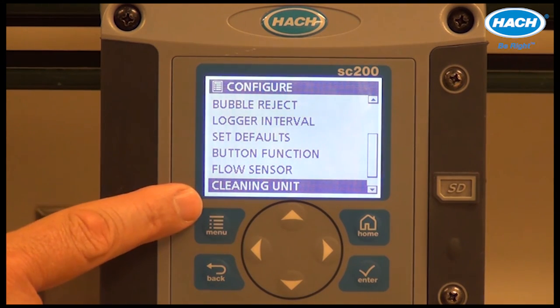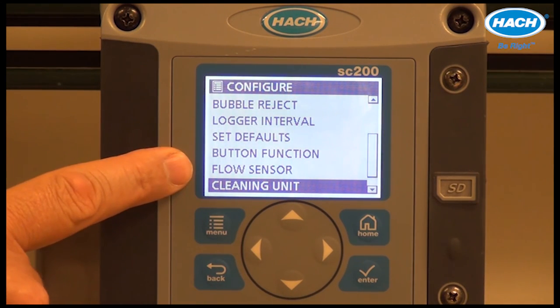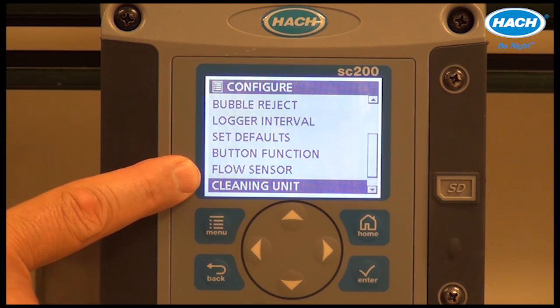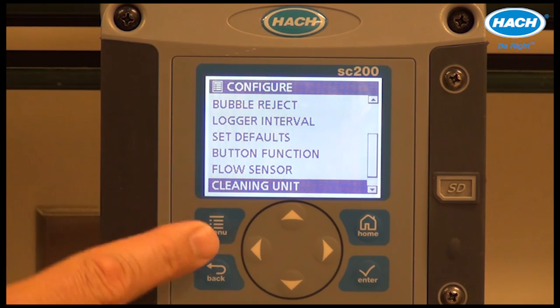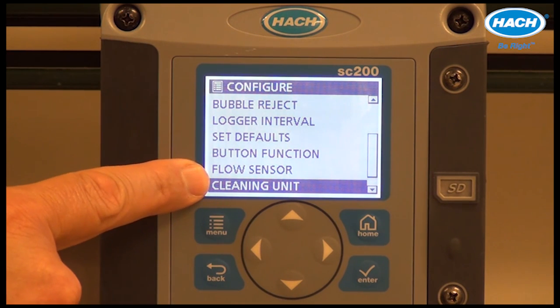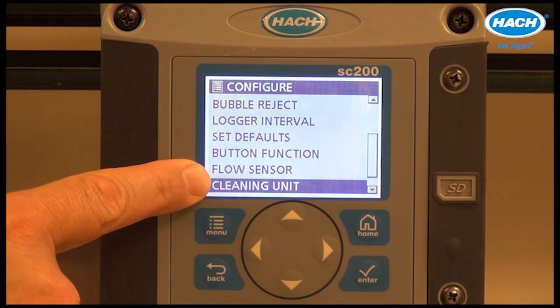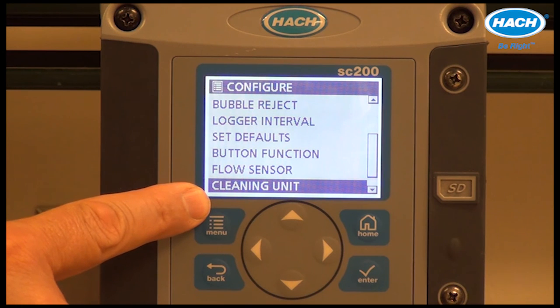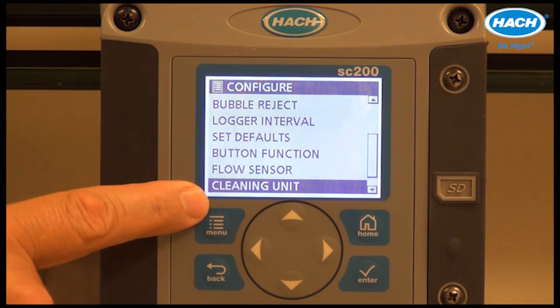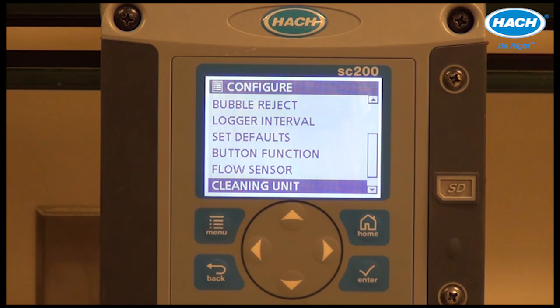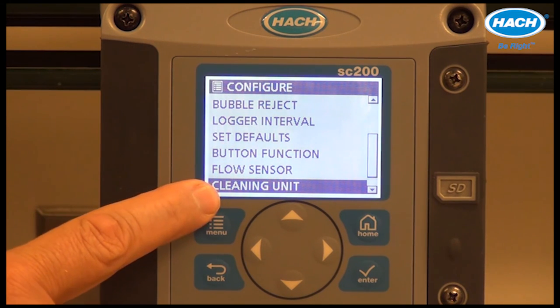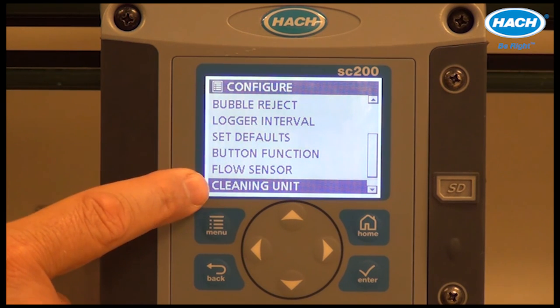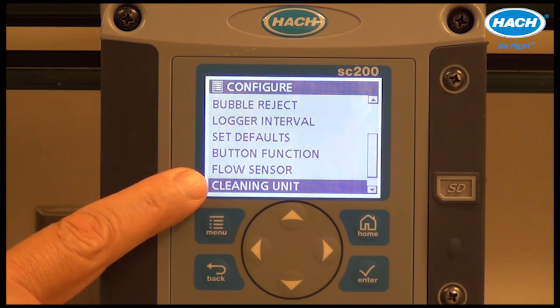The next two menu items — flow sensor and cleaning unit — provide control for optional devices and will be covered in a separate video. The flow sensor measures the flow rate of sample through the process instrument. The cleaning unit is an optional device to automatically keep the sensor vial or flow vial clean. Both are optional accessories that connect to the port on the back of the TU5400.